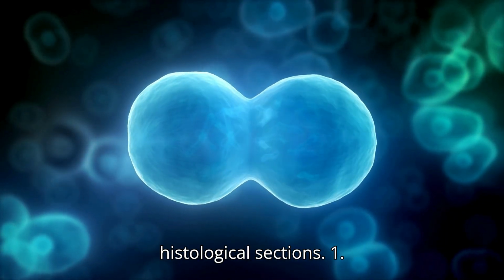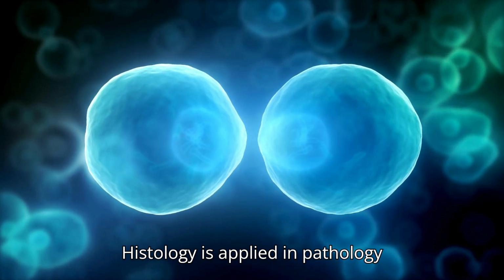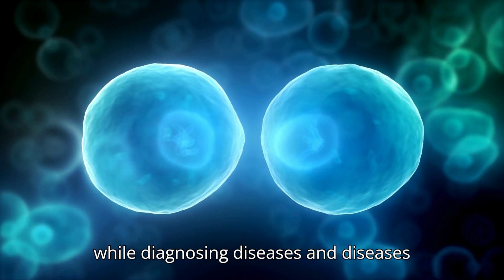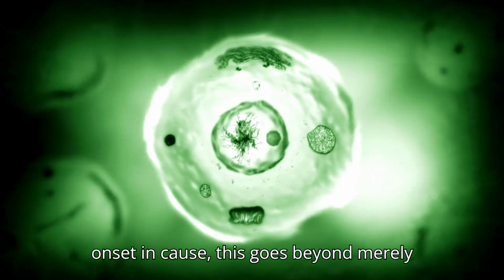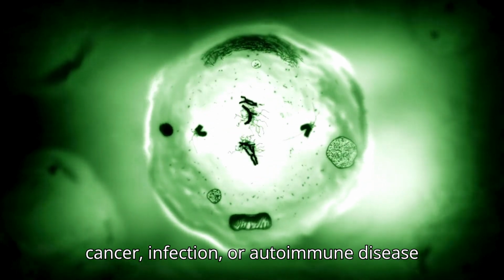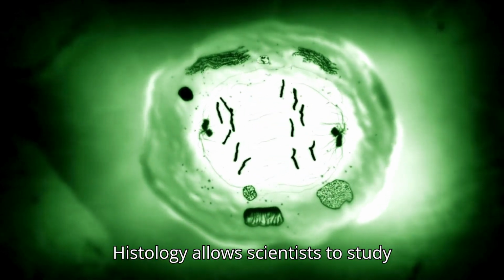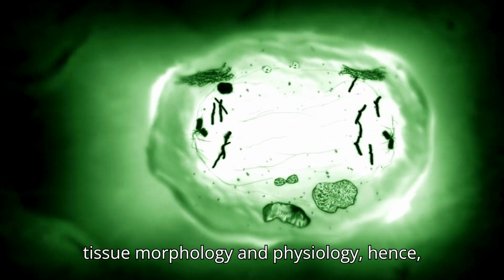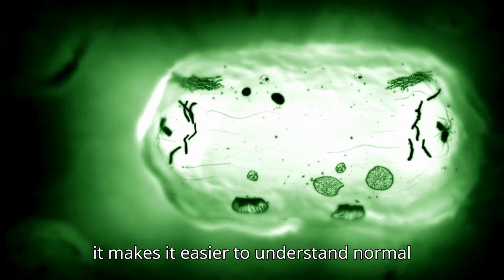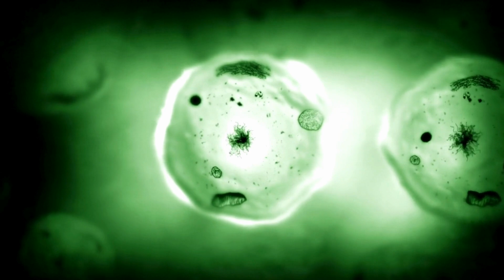Applications of histological sections. 1. Clinical diagnostics: histology is applied in pathology while diagnosing diseases and diseases' onset and cause. This goes beyond merely ascertaining whether it is a case of cancer, infection, or autoimmune disease, among others. 2. Research: histology allows scientists to study tissue morphology and physiology, hence, it makes it easier to understand normal biological processes and disease mechanisms.